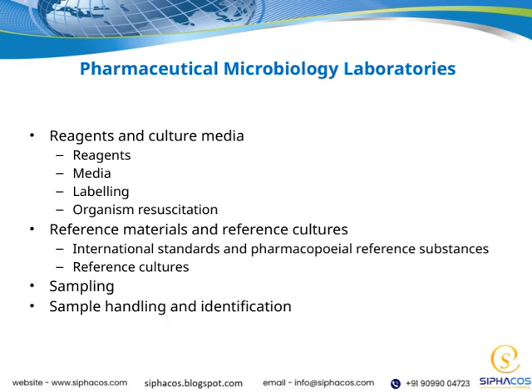Organism resuscitation is another key point. It's about reviving microorganisms from storage so they can be accurately tested and identified. Using reference materials and reference cultures ensures that our testing is reliable, as they serve as standards for comparison.